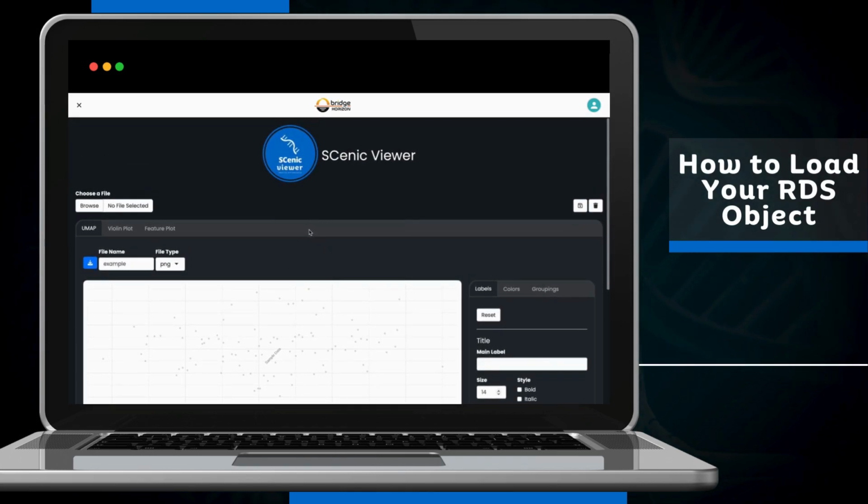I do want to mention that there is a 5-minute timeout. So if you let this application idle for 5 minutes, it will automatically time out and exit and bring you back to the applications library page.